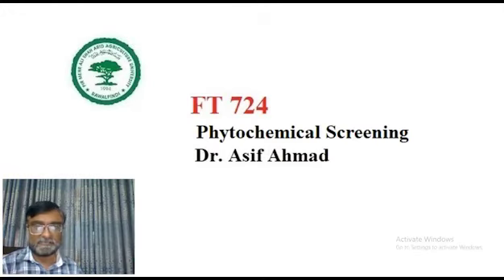Hi guys, today we will be discussing the practical of phytochemical screening. Most often, especially from plant sources, we have to screen the substances from the plant sources on the basis of the phytochemicals present in the extract. So we will be proceeding with today's lecture.